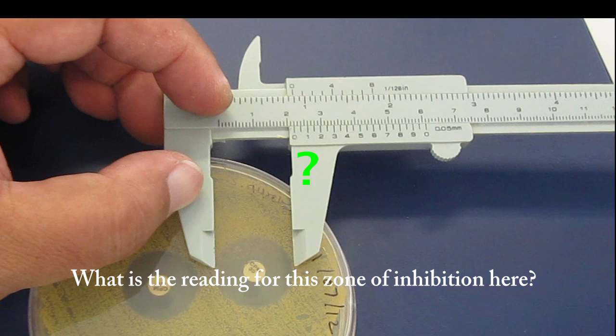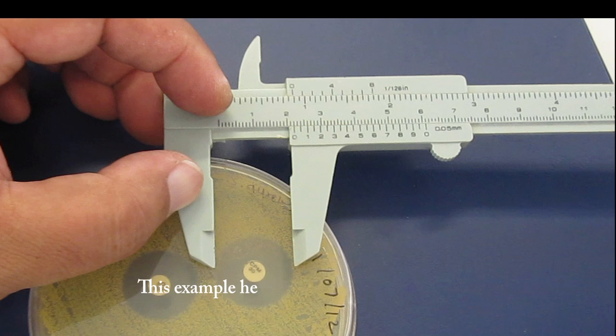What is the reading for the zone of inhibition here? This example here shows a reading of 22.1mm.